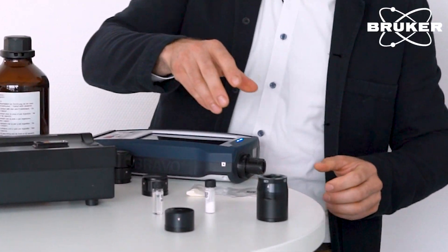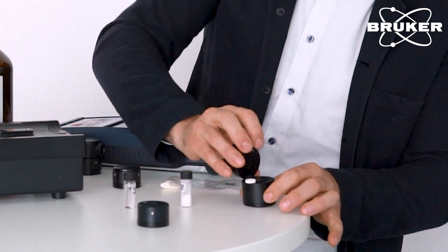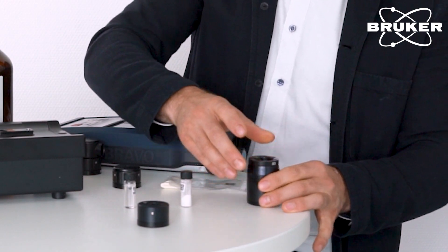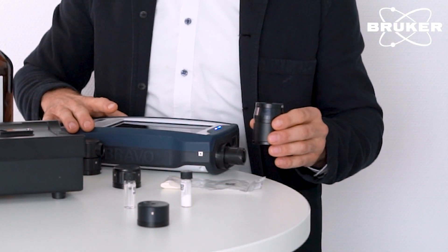Measurements in tablets are also supported. For that, we have this measurement adapter where we can place a tablet on a spring-loaded barrel, just close it, and attach it to our handheld spectrometer.